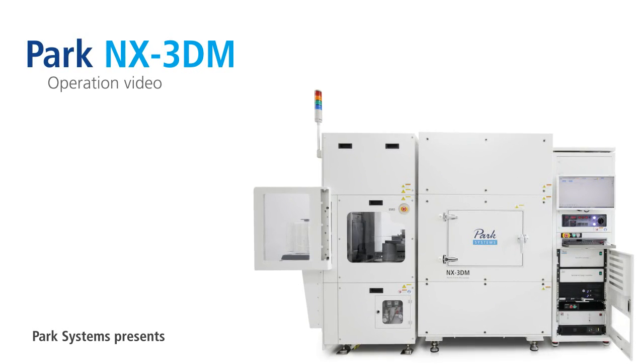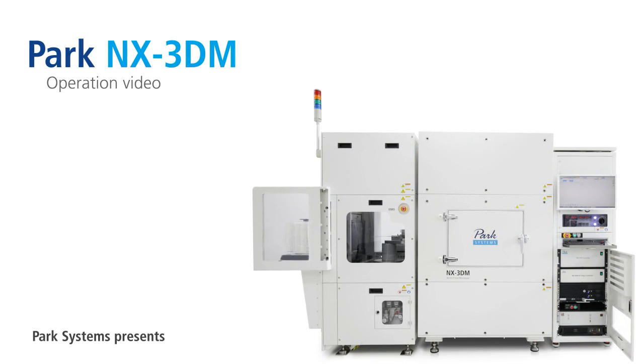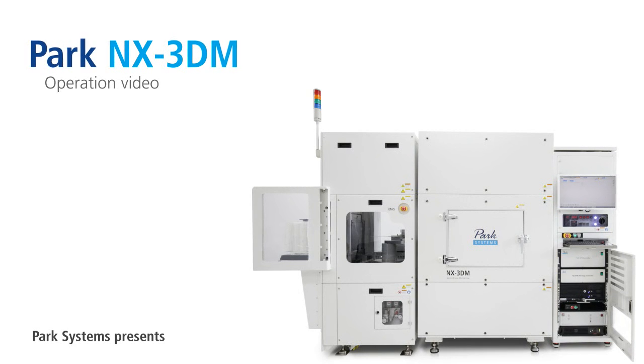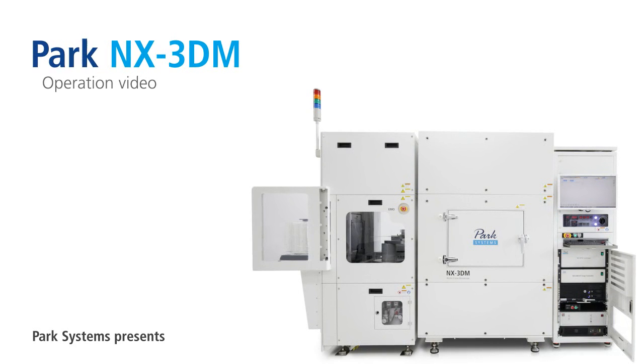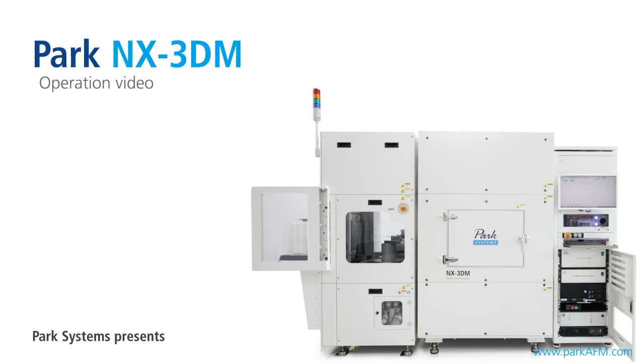Introducing the PARC-NX3DM, a special AFM system capable of measuring 3D structures and automating measurement and analysis for industrial use.